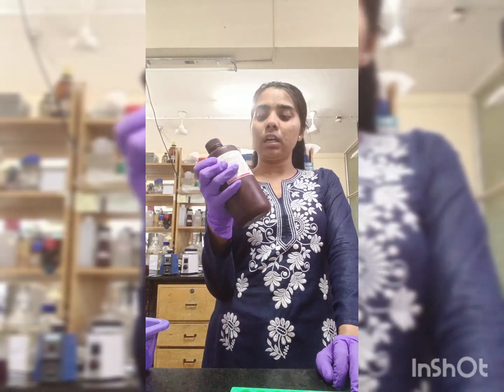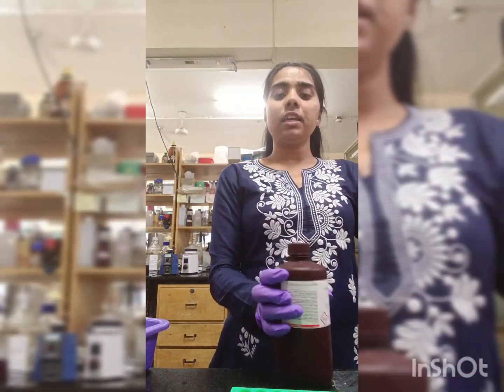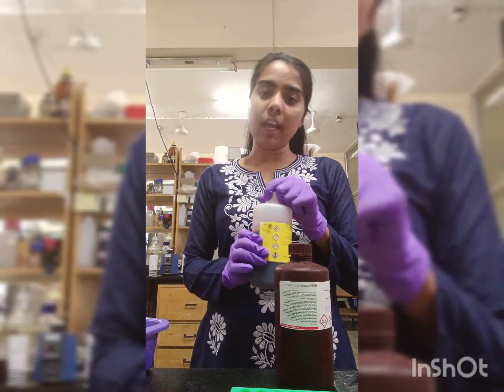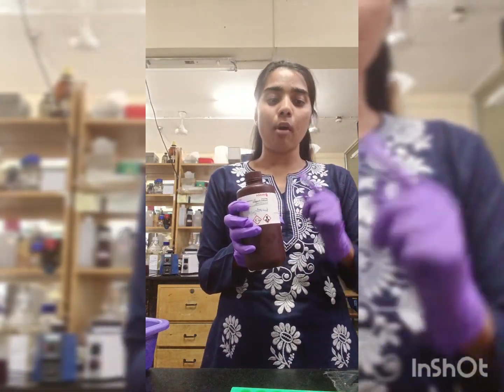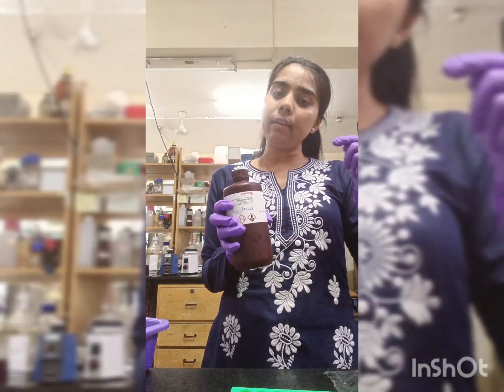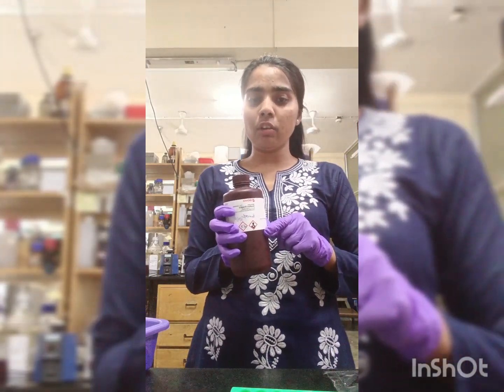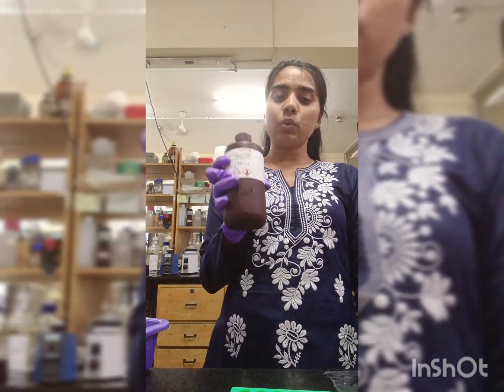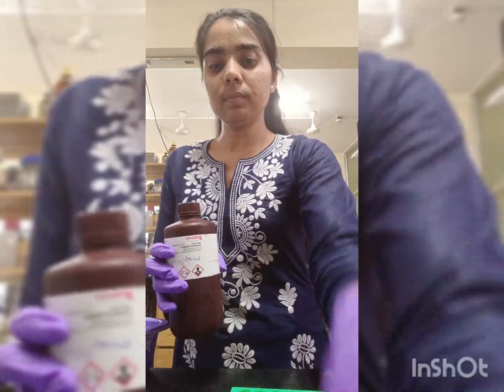In this experiment I will use this diluted Bradford, because if I use the other one I have to first dilute it and then use it. This is already diluted and I made my standard curve of Bradford with this. So I will use the same standard curve for detecting my protein concentration directly from the absorbance.